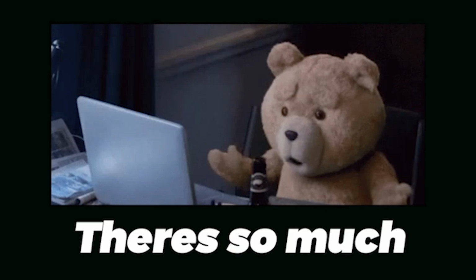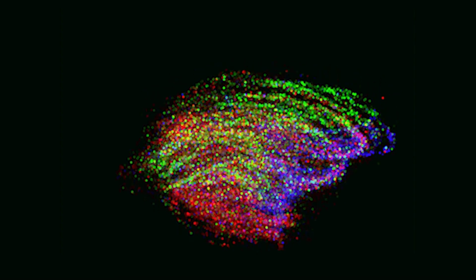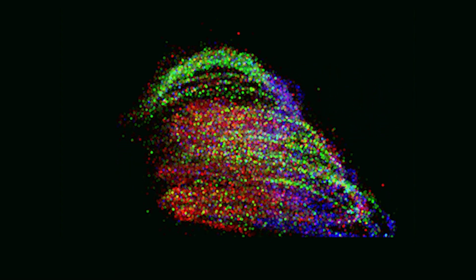There are many modern RNA-Seq methods which have improved upon the classic bulk approach. Single-cell RNA-Seq measures RNA transcripts of individually partitioned cells. This allows for identification of specific cell types in the sample based on their transcriptomic profiles. Slide-seq and GeoSeq build upon this by capturing spatial data to the detected transcripts prior to sequencing. This lets us know what's being expressed at a given tissue site.